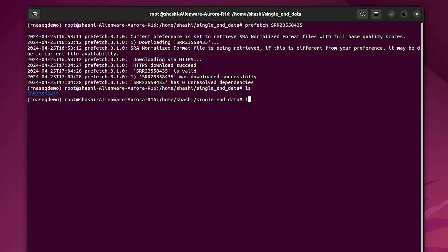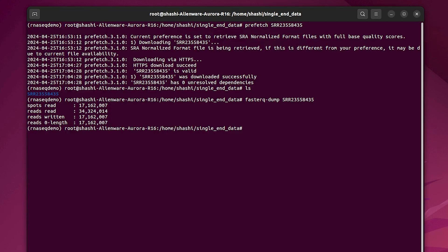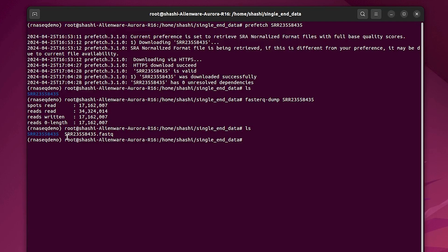We can check that using 'ls'. The next step is extracting the FASTQ file from the SRA file. The command is: 'fasterq-dump SRR_ID'. Press Enter. Now checking with 'ls', here you can see the SRR_ID.fastq file, so we have successfully extracted the FASTQ file from the downloaded SRA file. In this way we can download the single-end RNA-seq data and extract the FASTQ file.